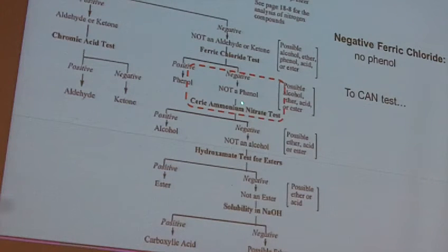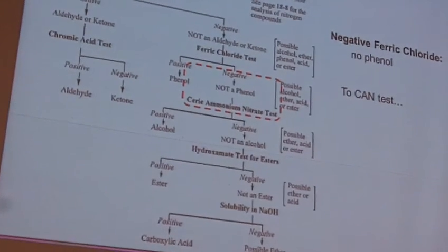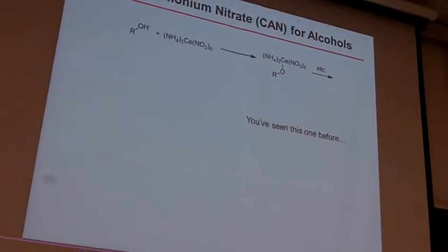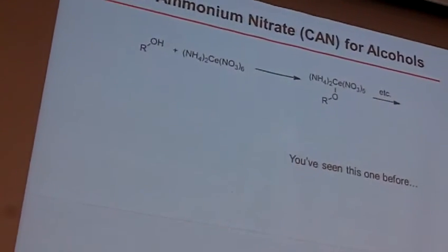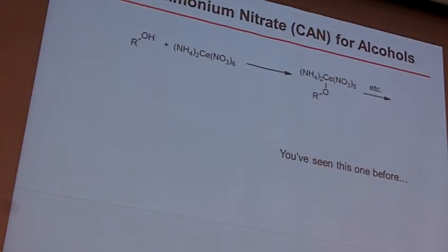If it's not a phenol, the next thing we do is we test for alcohols. The ceric ammonium nitrate test, hopefully this one sounds familiar. This is the CAN test. You've seen this one before. That's what the compounds look like, and that's just a gobbledygook of what the reaction is. We can just get a complex and it changes color. The key is we change from the yellow reagent, and in the positive test it will turn to an orange-red.